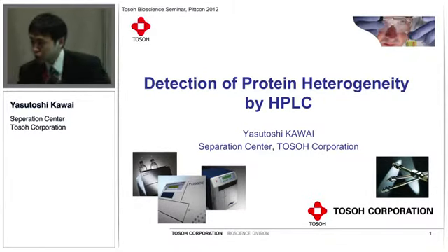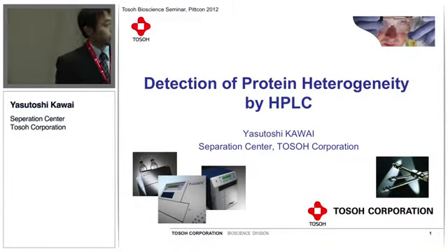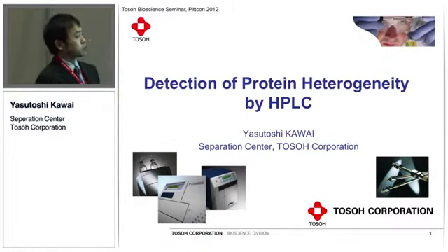Today I'd like to talk about the detection of protein heterogeneity by HPLC.